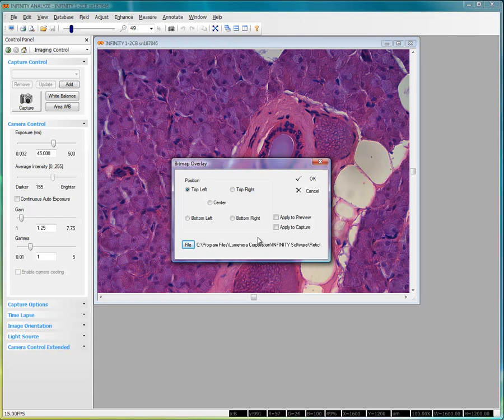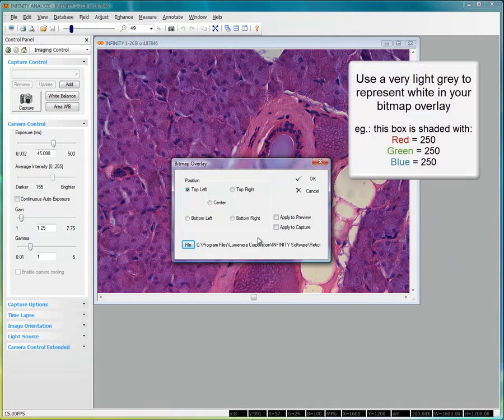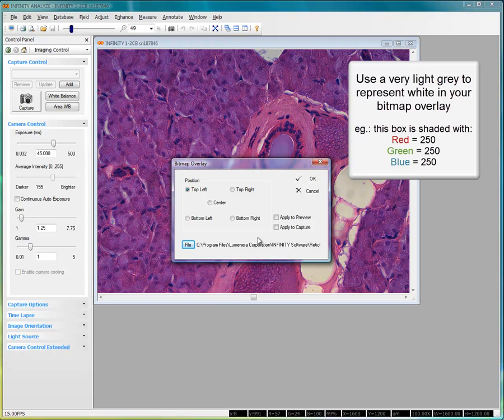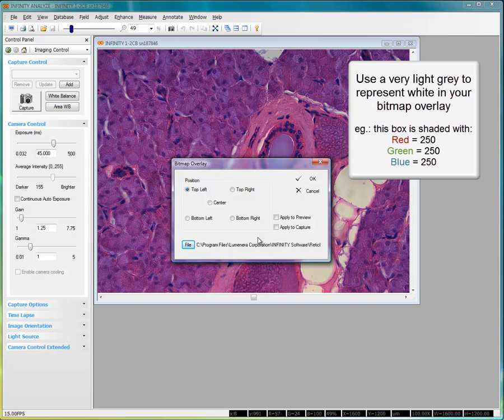If you want your bitmap overlay to include the color white, simply set the red, green, and blue pixel values for those areas to a very high value, but not quite maximum. For example, 250, 250, and 250 for the red, green, and blue color values.